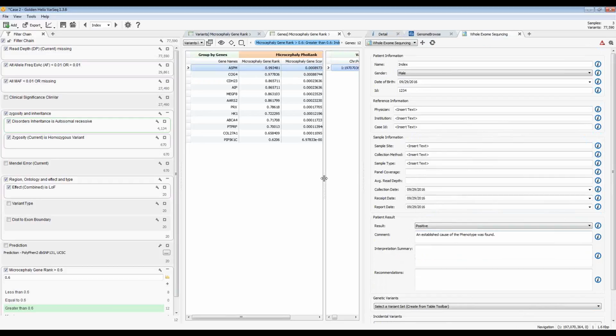I think that's it. I just don't want to go into a deep filtration process. However, I believe it's a very powerful tool for filtration, but I want to show how it could be a very useful time-saving tool, from our experience, that we could reach the pathogenic variants very easily within a very short time. If you have any questions or comments, please feel free, and then I think Hauwa will walk through some report customization.